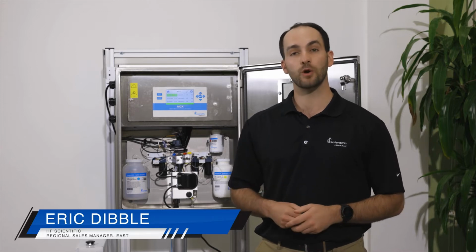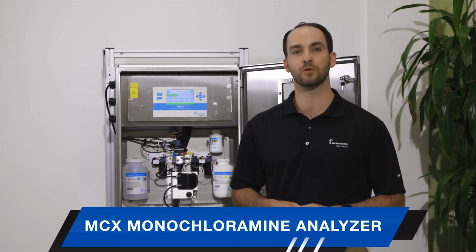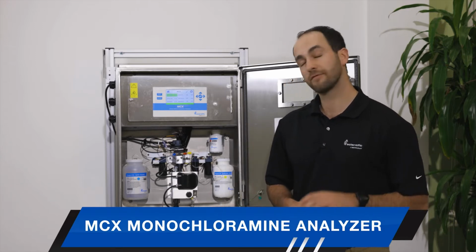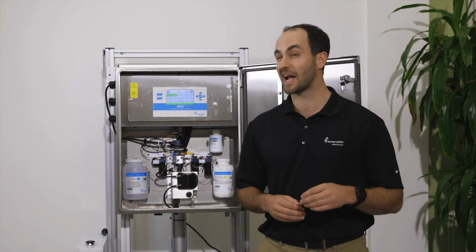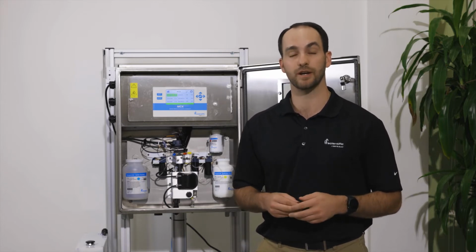Today, we're going to be going over how to do a calibration on HF Scientific's MCX Monochloramine Analyzer. The first thing I want to mention is that calibration is not required for this analyzer when you first get it. It will come factory calibrated.